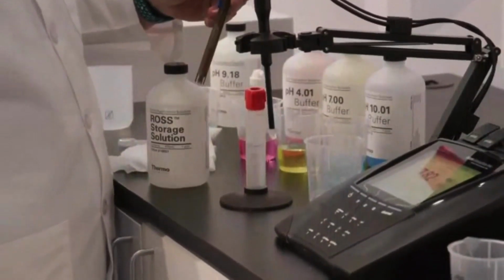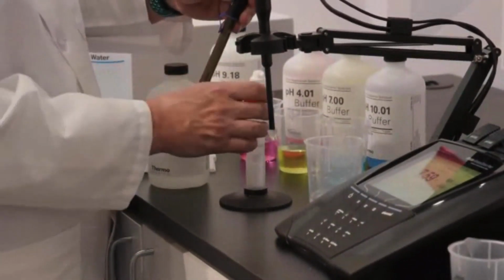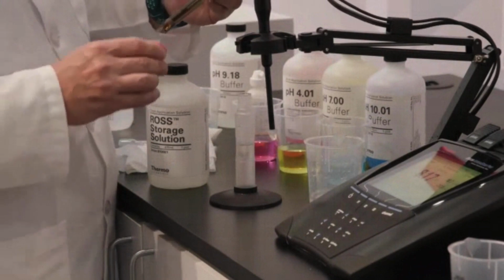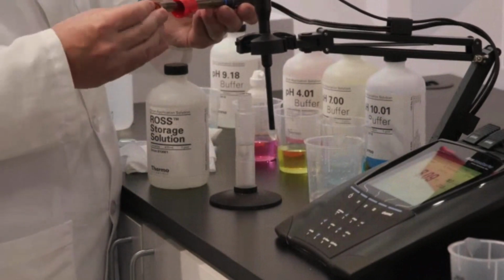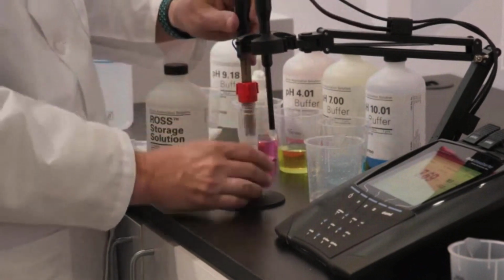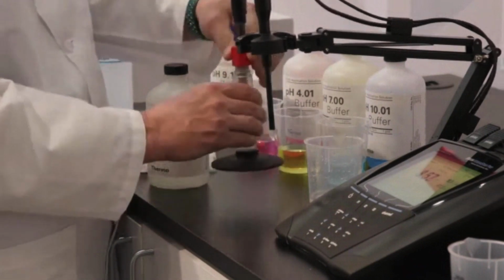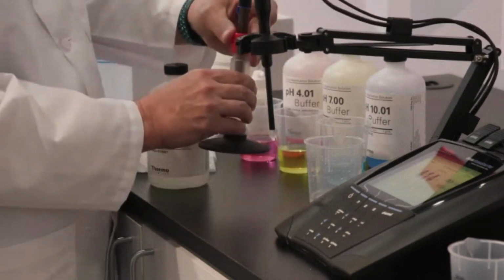Okay, now he's going to cover the fill hole. Great. And show us how to get the electrode back into the storage bottle without causing any air bubbles. So he'll undo the cap, slide it onto the electrode body. And then place the electrode back into solution, making sure that the bulb and the junction are immersed in the storage solution. And then put the cap on.